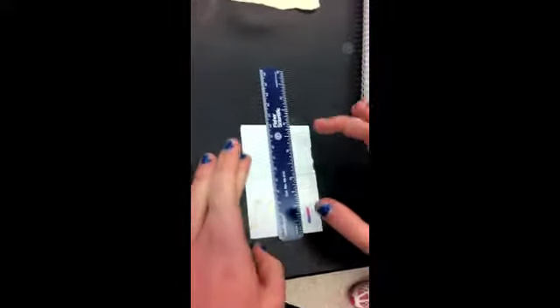Okay. After our TLC paper is dried, we are going to find the RF factor, which is the distance traveled by the component over the distance traveled by the solvent. To find the distance traveled by the solvent, you measure from the bottom of the paper to the solvent line, which is approximately 5.1. And then I'm going to put that in your notebook. And then you find the distance to the center of the darkest point of each dye.